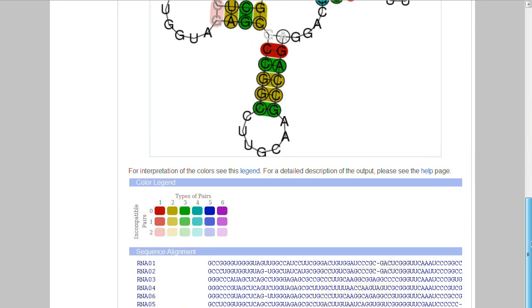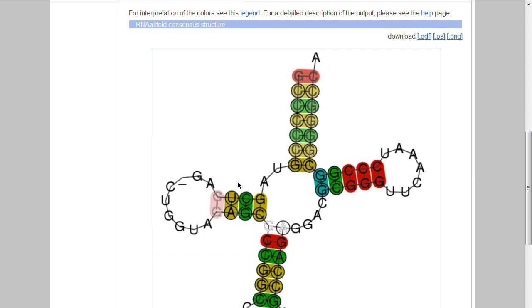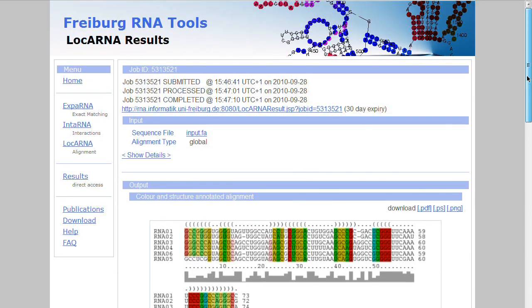At the very bottom you also have the alignment again in text form that you can cut and paste. Of course, you can also download these files — the alignment and the consensus structure. That's it for this tutorial. I hope it was useful for you. Have a good day.